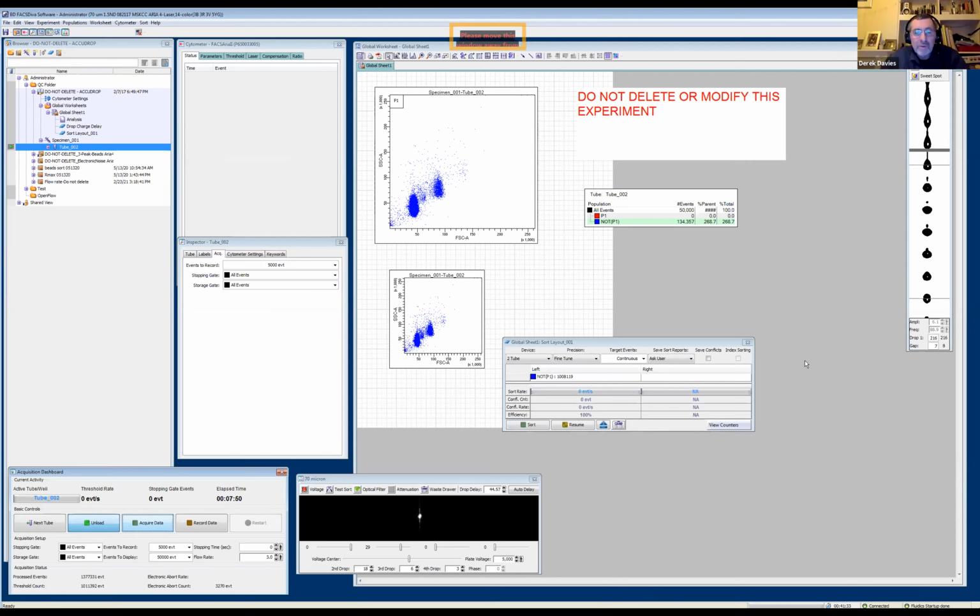Yes. What we see in that window at the moment is just reflected light. When we actually put the beads on, we put an optical filter in front of the camera, so we're only letting light above 700 through or something like that, which is going to be the emission of the beads. The fluorescence of the beads, exactly.